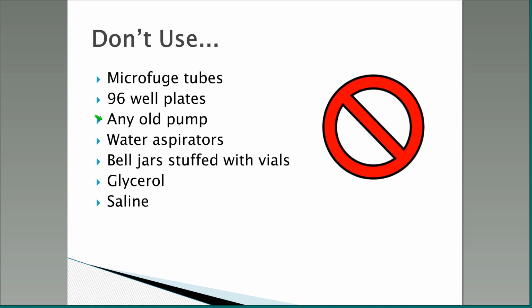Don't use any old pump for freeze drying, all right? You need a good pump, which leads me right into the next thing: I've seen people who've tried to freeze dry using a water aspirator. Another bad idea, considering you're trying to get the water away from this thing and you're using water to create the vacuum. Bell jars stuffed with vials don't work well because you get uneven heat transfer. If you're going to do massive numbers of vials, I would recommend using a shelf dryer.